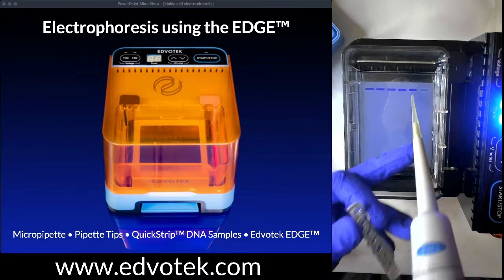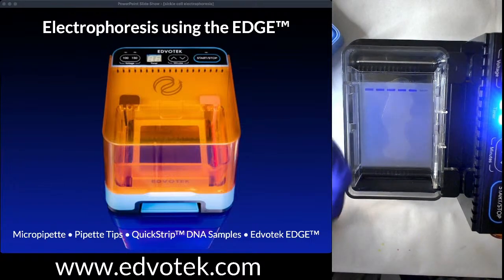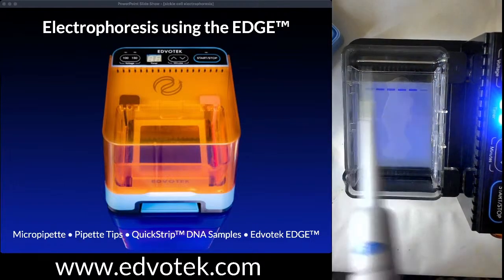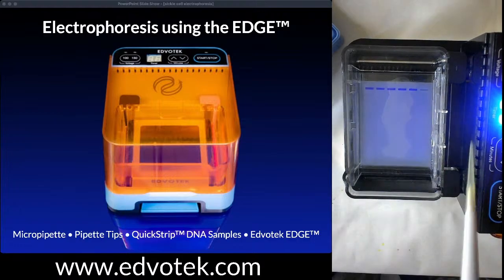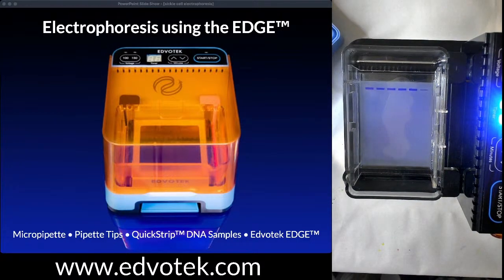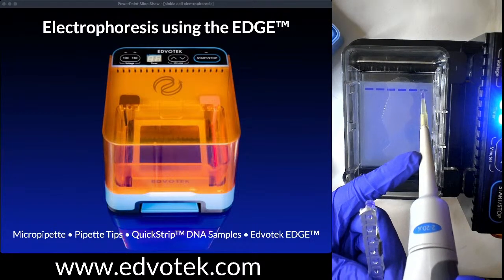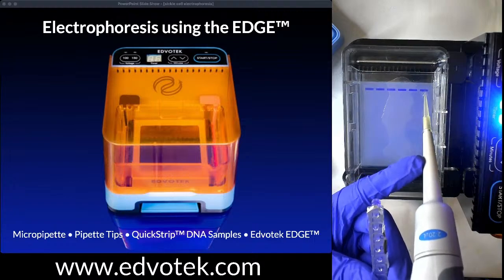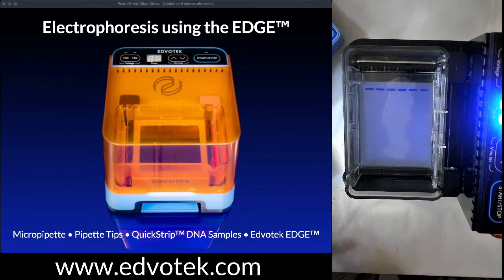Get that last sample in there. And then we've got one more sample to load. And so while you're looking at this, what you should see is that our electrophoresis chamber is going to have electrodes wired into either end of it. The leads are plugged into the integrated power supply, and that's going to actually generate the current that we need to perform electrophoresis, so that we can push our DNA samples through the gel.